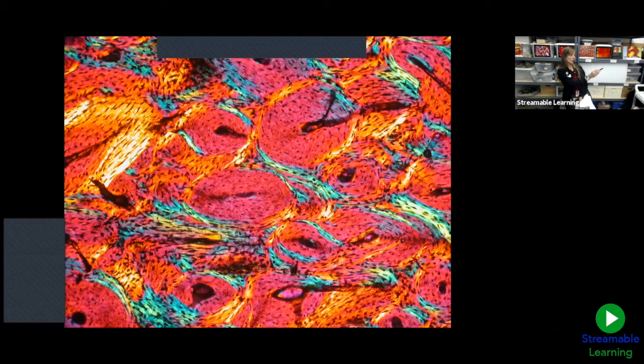Great. So this wave plate then further changes the angle of receipt of the wave before it comes to your eye, and then instead of just light and dark patterns, it actually changes it to a whole variety of colors, again, depending on how thick your specimen is and what minerals make up your specimen. I'll put the wave plate out.